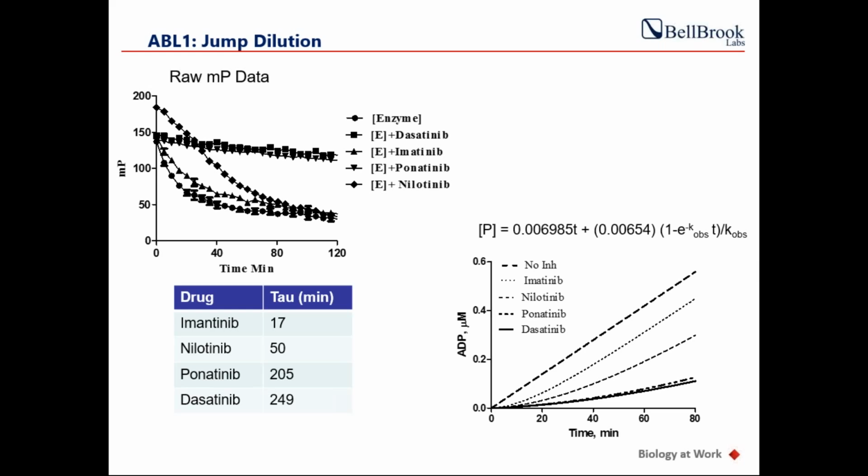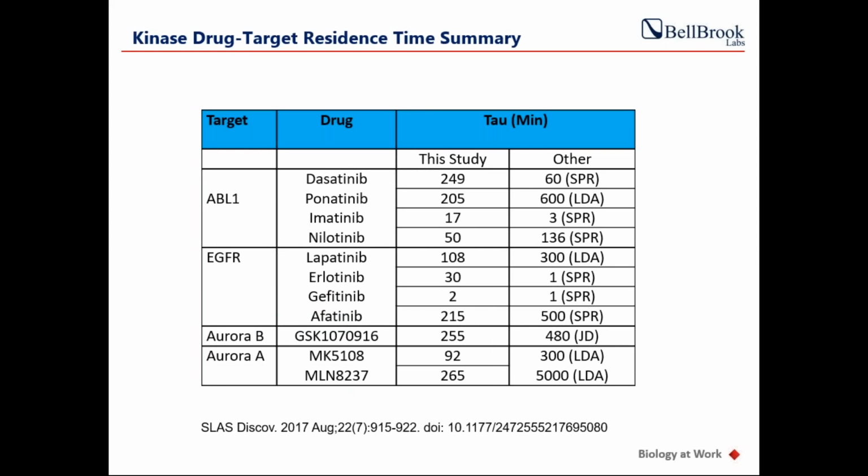So it's quite powerful that way, rather than running separate SPR reactions, or even if you're using a multi-channel SPR instrument. There's a lot more involved in terms of optimizing the attachment of the enzyme to the chip and all that kind of thing. This is all in solution, and we're looking at dynamic catalysis. And this is from a paper we published just last year. It seems like longer.